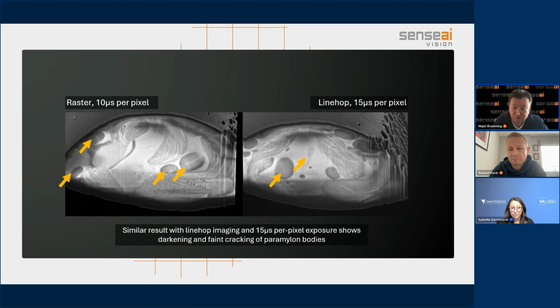Now, that doesn't mean that that's the only level of subsampling you can do. It just means that that's the one that you can do without having to worry about how accurate the reconstruction is going to be. Testing it on places where we have beam damage or where we have charging, of course, is impossible to do, because if you could get the image without charging or without beam damage, you would never want to use the sparse sampling. The sparse sampling is correcting for an effect of the beam. So we don't have the ground truth in those cases. And so we tend to go with just the ones that we've known work very well in every single case that we've looked at. But as Roland was saying, this is a way of balancing.